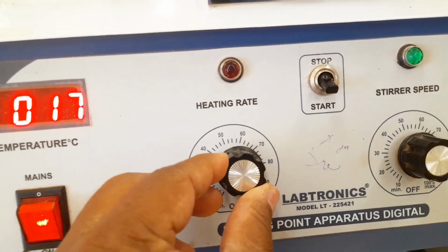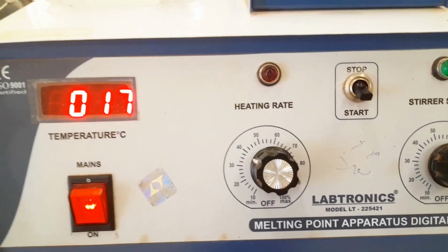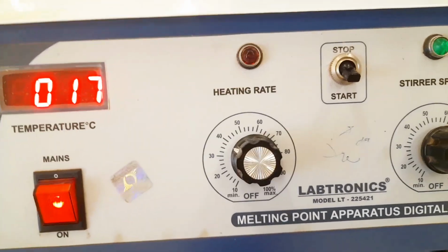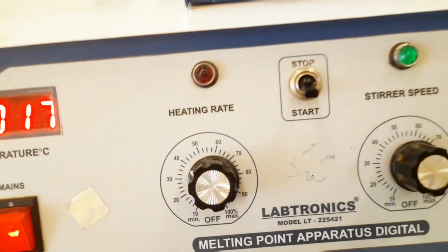We can decrease it when it reaches 100 degrees centigrade. We can decrease it a little bit, so that we arrange for every 1 degree centigrade rise of temperature over 10 to 15 seconds. We have to observe, because at any time the sample may convert from solid to liquid. Like that we have to make an arrangement.